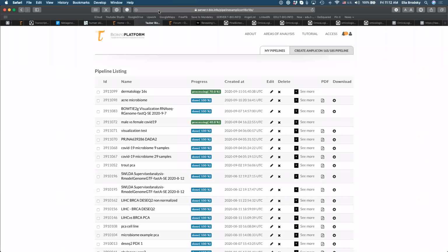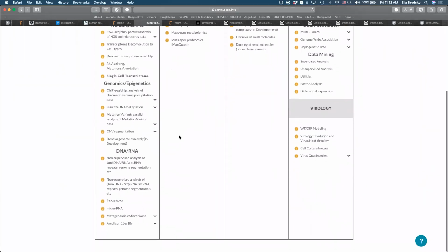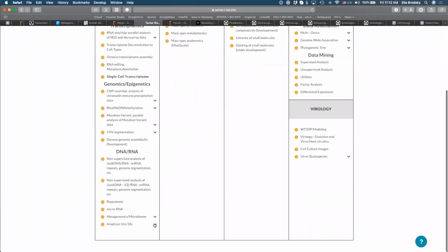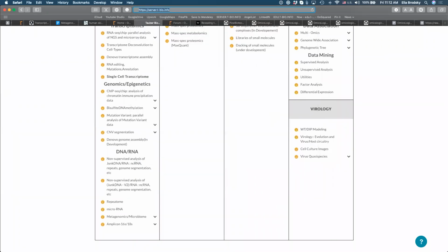Okay, if you go to the demo pipeline, I'll show you where to download all of the files. So if you could please go with me to server.t-bio.info. Let me know once you are here.